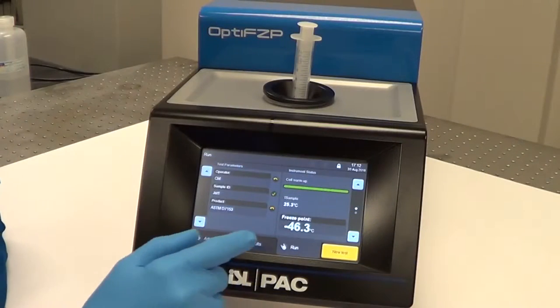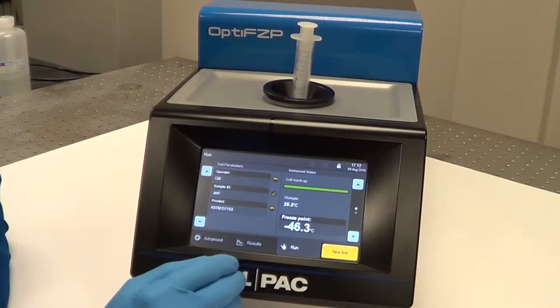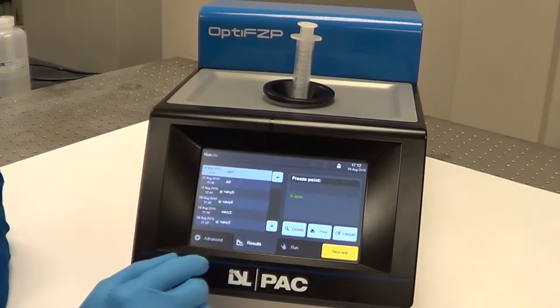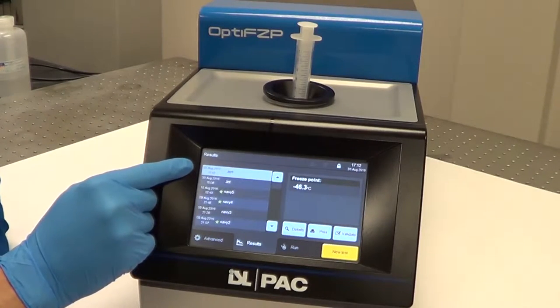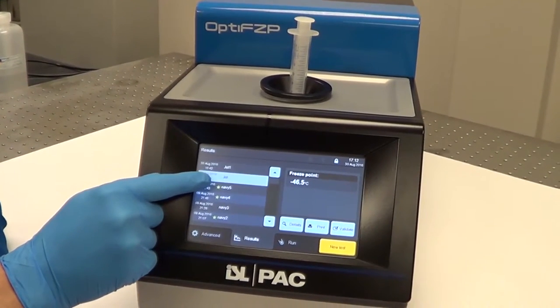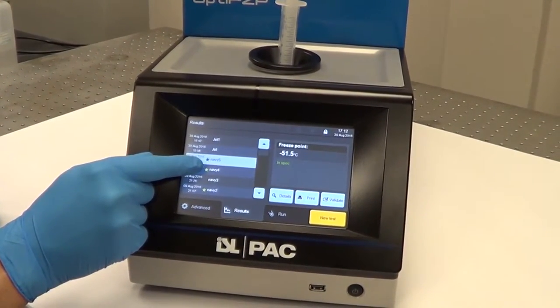Now that our test is completed, you can see your results here on the main screen. You can also go to the results tab. And your recently completed test will be here at the top. Previous results, you can just work your way back through the list.